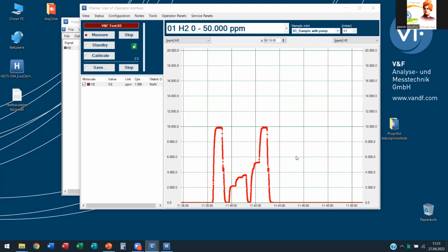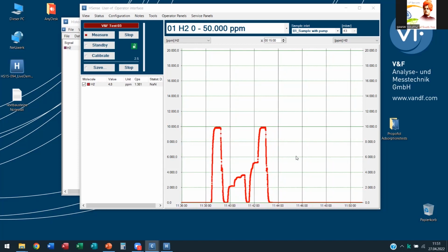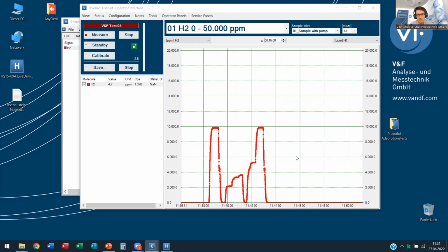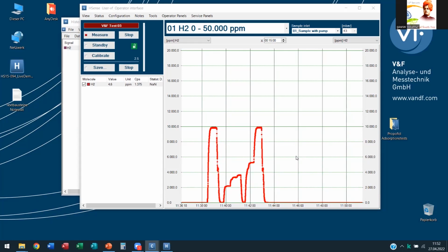I wanted to understand, is this a separate system, or is it embedded inside the same system? No, it's a separate system. We are using gas dividers that are separate instruments to provide gas mixtures to the HSense instrument. Okay, thanks. No problem.